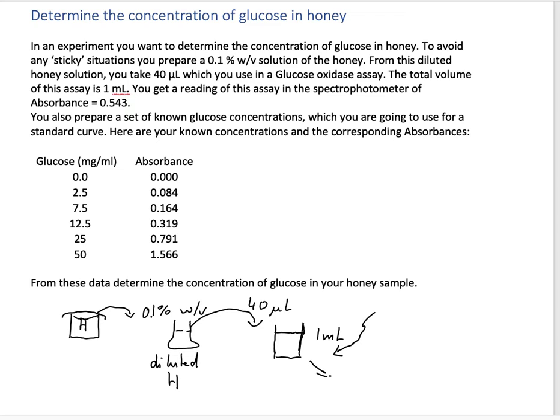We get an absorbance of 0.543. That's the basic scheme. Now we need to figure out how to prepare this 0.1% weight per volume solution in the first place.